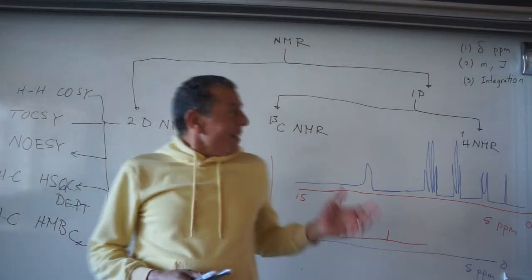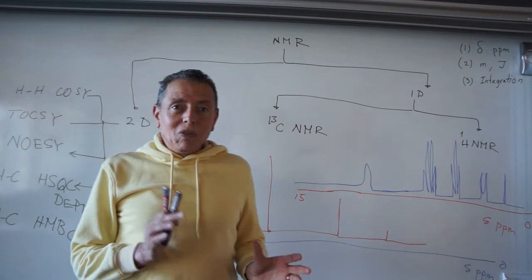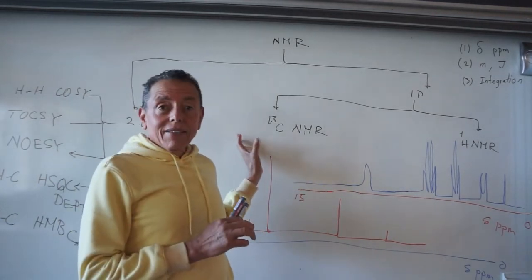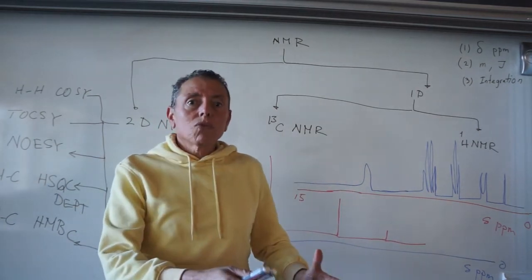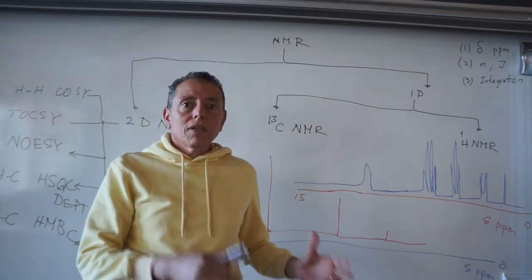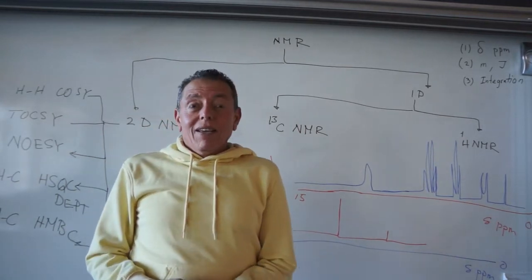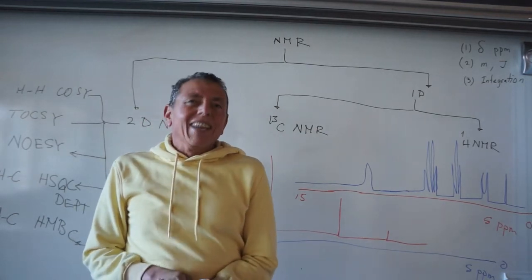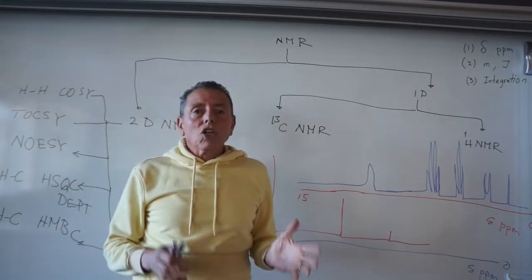Everybody. I would like to explain to you just a short introduction about NMR, and if you understand these basics of NMR, then you can go to my videos of solving problems and so on. After that, you can practice on your own structures, and definitely you will love the NMR after that. So the aim of NMR is structure elucidation.